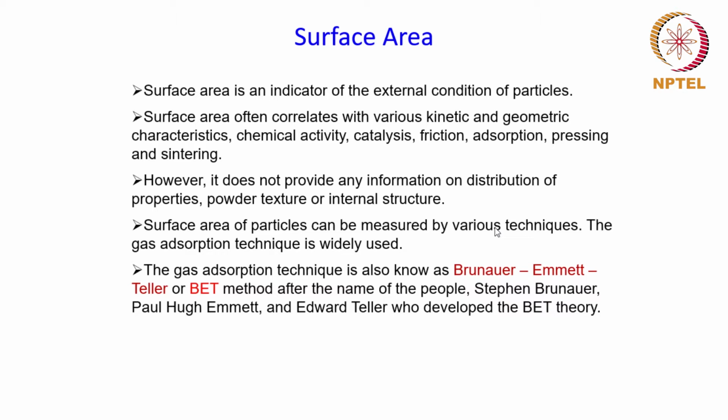Now, the basic principle behind this technique goes back to the Langmuir adsorption theory or the Langmuir isotherms. So let us first talk about the Langmuir isotherms, and from that we'll get to understand the basic principle behind this BET method.